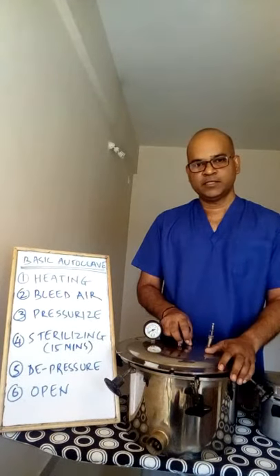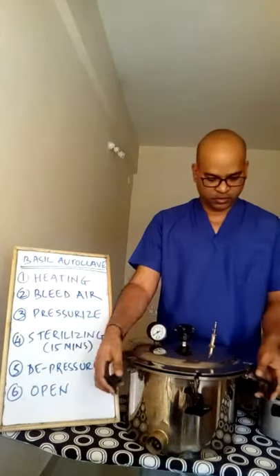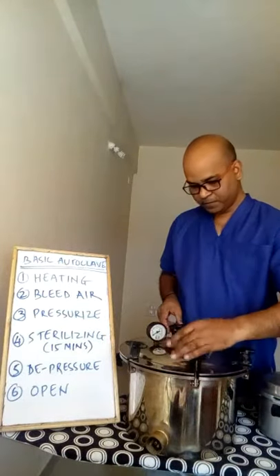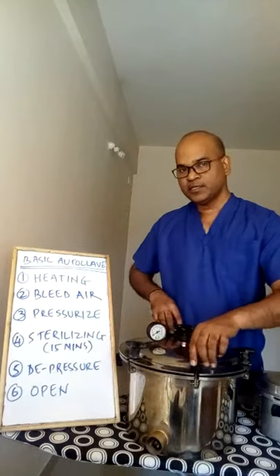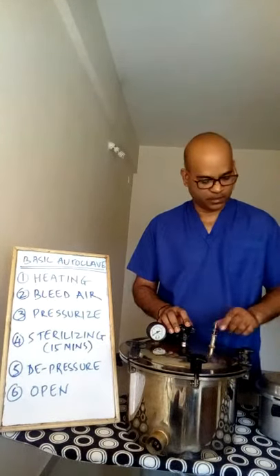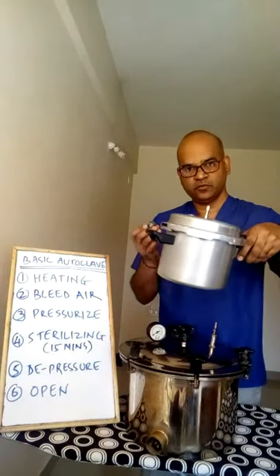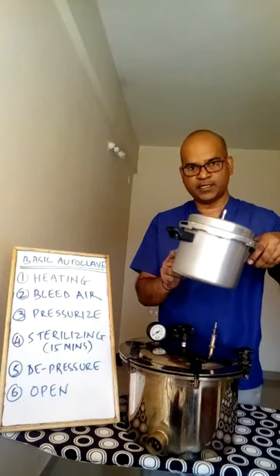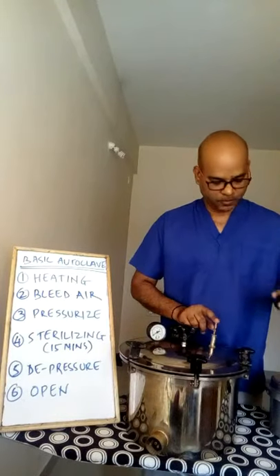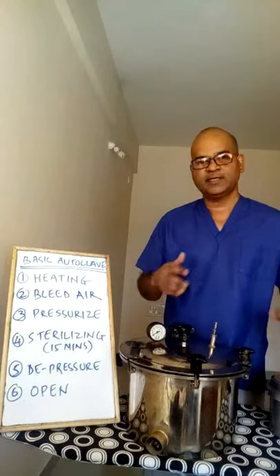Once your instruments are inside, close the autoclave tightly and evenly from all sides. Most importantly, before you start, make sure the valve is open. If you're using a pressure cooker type autoclave, take the weight off when you start heating. Start your heating with the valve open.